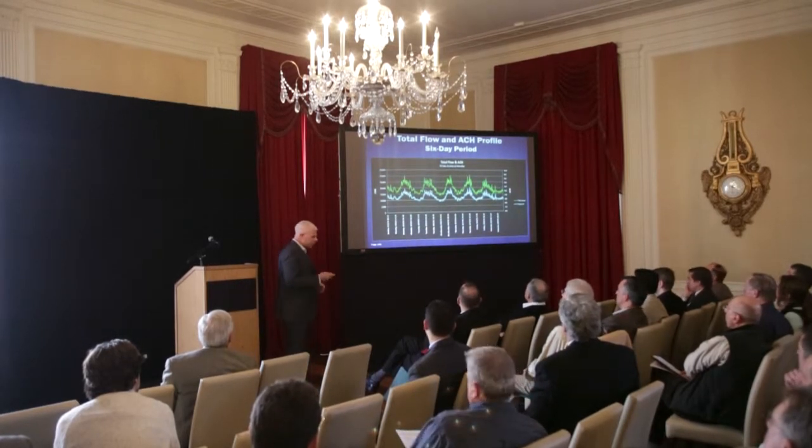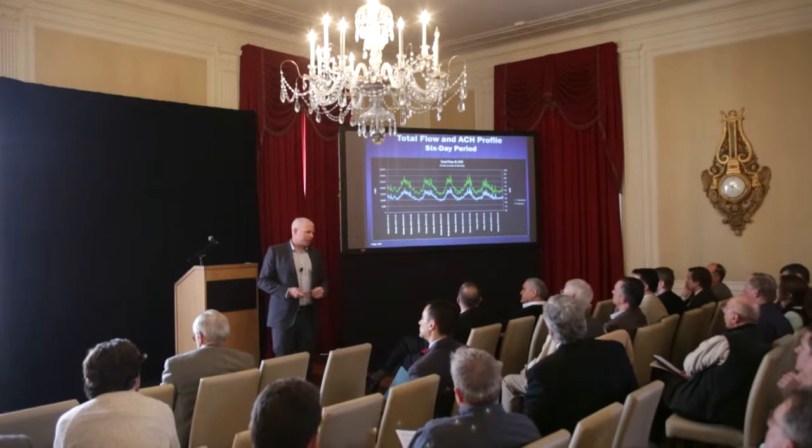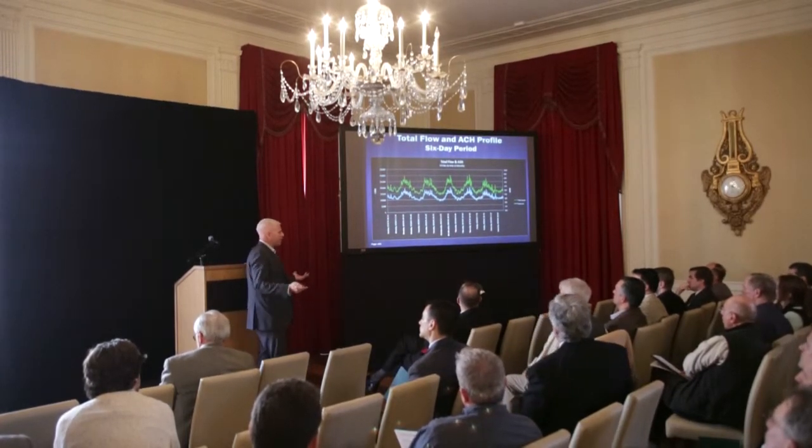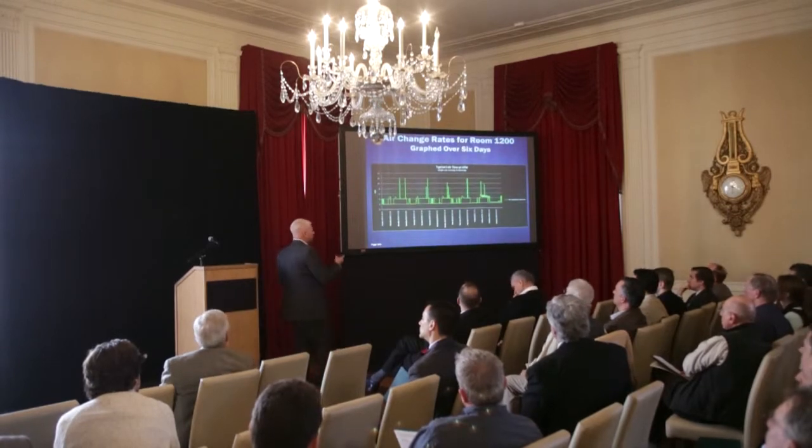So when you hear, yes, they're running at 2 air changes, or they're running at 4 air changes, we're not really running at those numbers. That's just the minimum. Everything else is an input. So here you go. Here's a typical lab profile.